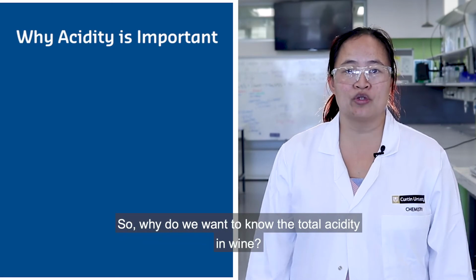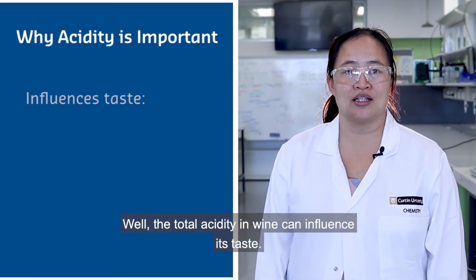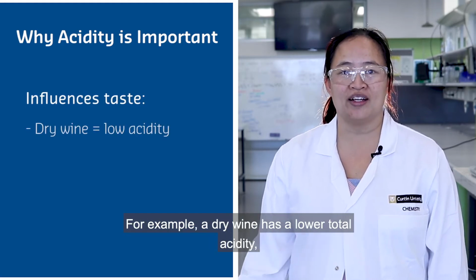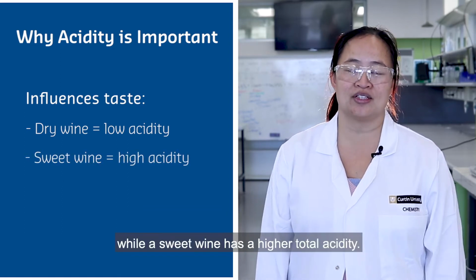So why do we want to know the total acidity in wine? Well, the total acidity in wine can influence its taste. For example, a dry wine has a lower total acidity, while a sweet wine has a higher total acidity.